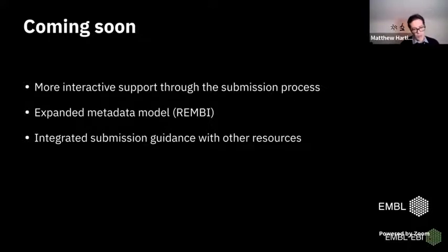We will be working on a new metadata model, and that'll be the next slide, so I won't talk about that immediately. And finally, we're looking at how we integrate both submission guidance and submission systems with other imaging resources, particularly with EMPIAR and IDR, which I mentioned, because sometimes it can be a little bit confusing, particularly if you're doing something like correlative microscopy, where you might want different types of data going to different places. Understanding how that process works is something we'd like to make smoother.